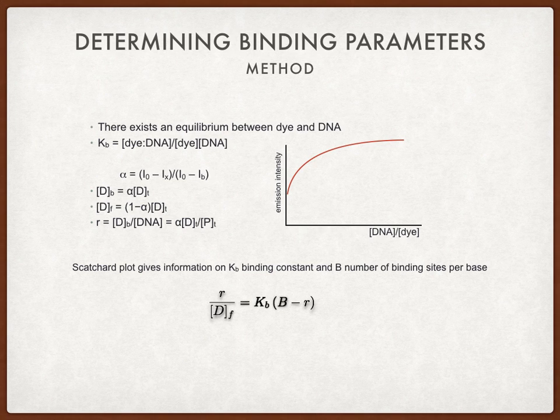The reason I've used DNA is because some of you might have done the third year experiment where we measure the binding of a dye to DNA. Essentially, it looks at the change in emission when we bind a molecule to DNA. It's assumed that there will be an enhancement of emission upon this binding, and so we see this increase of fluorescence intensity.